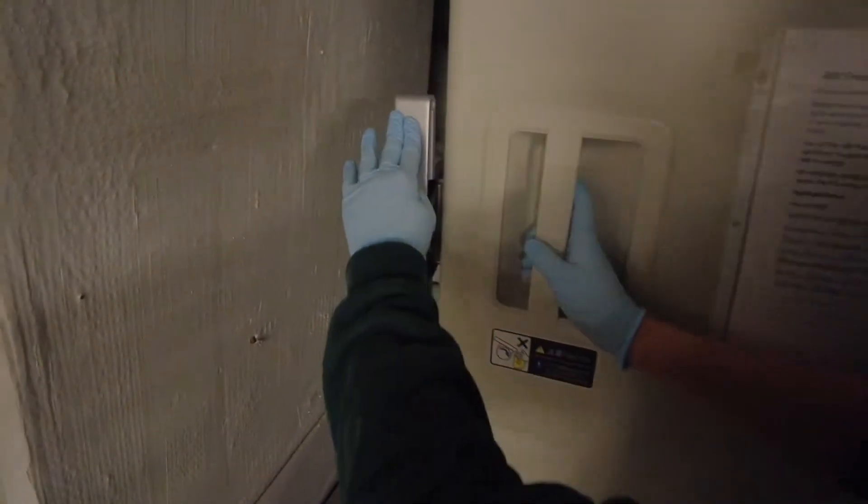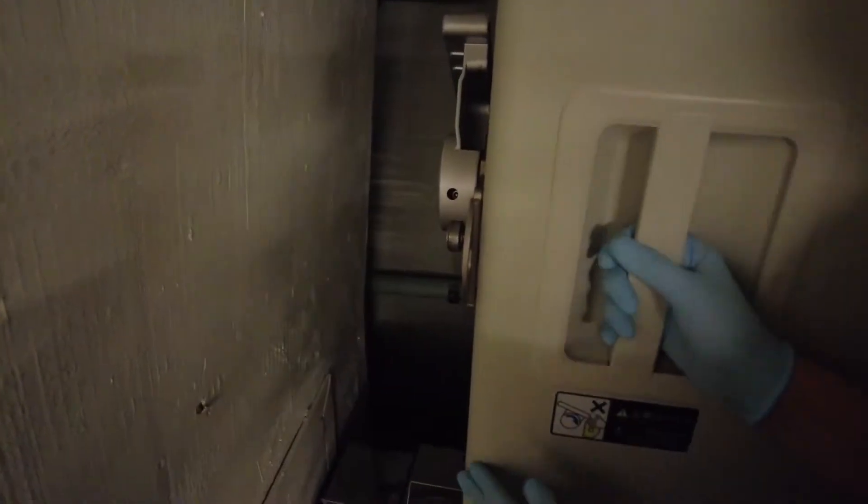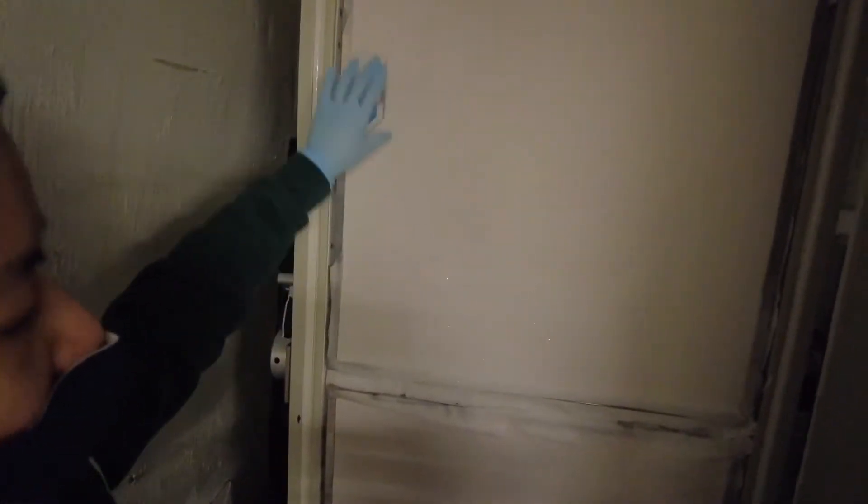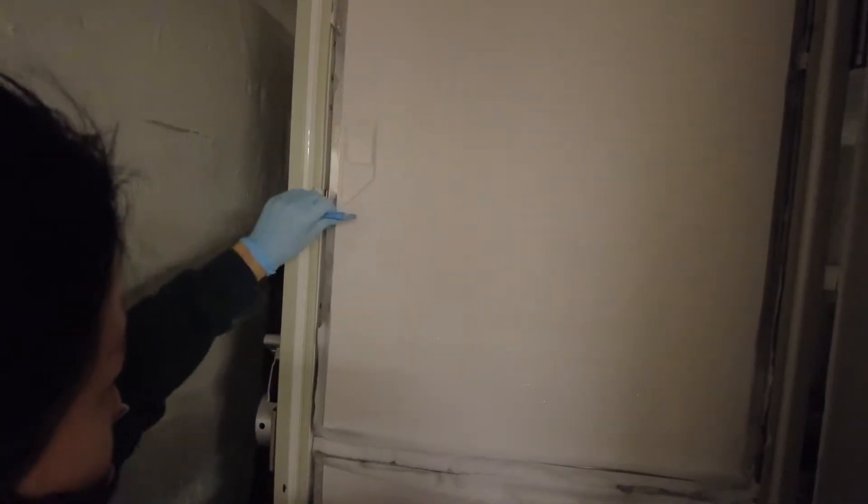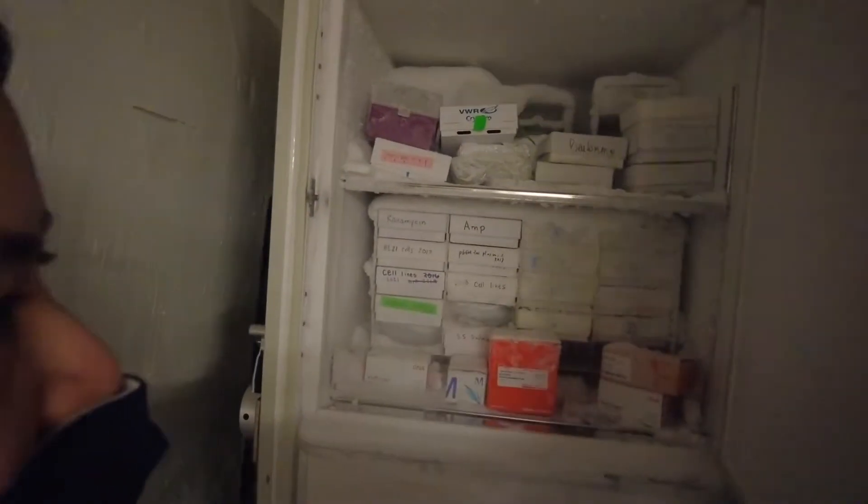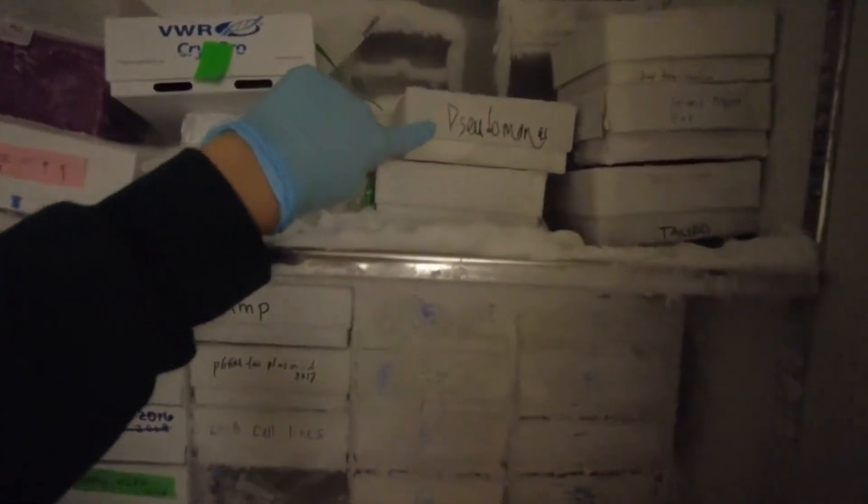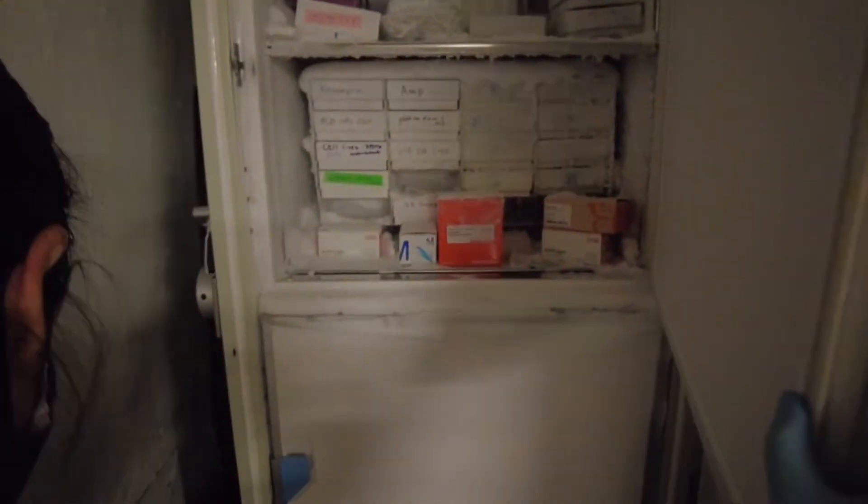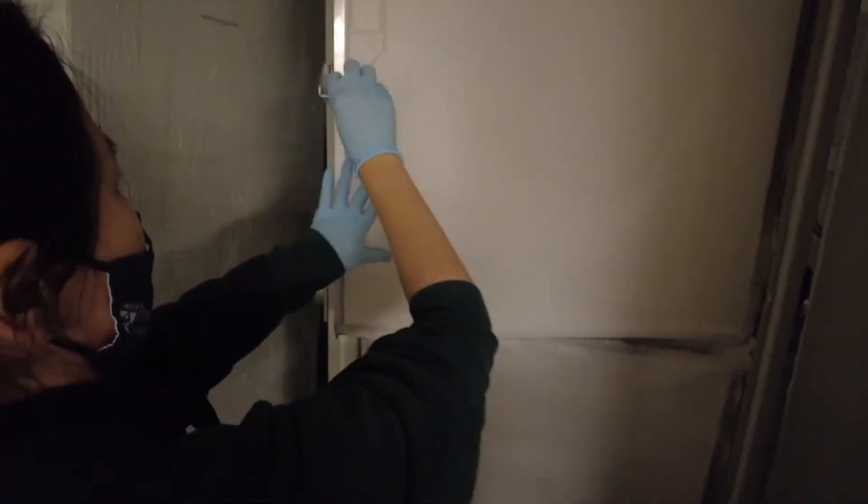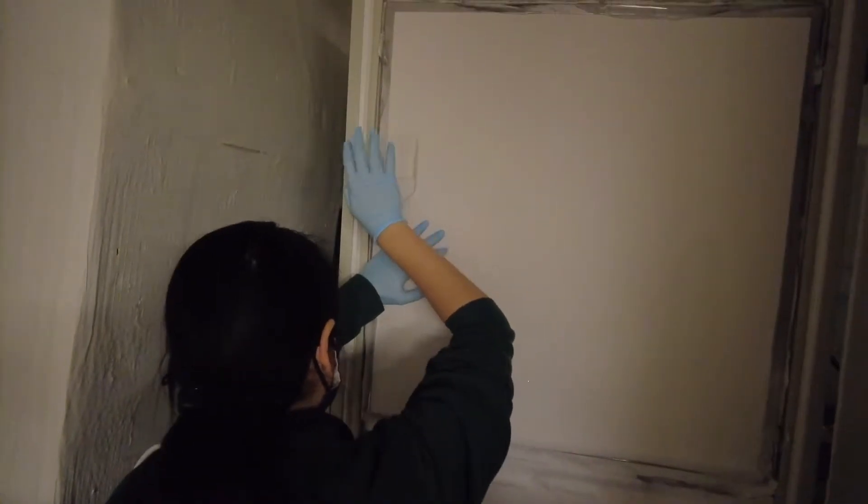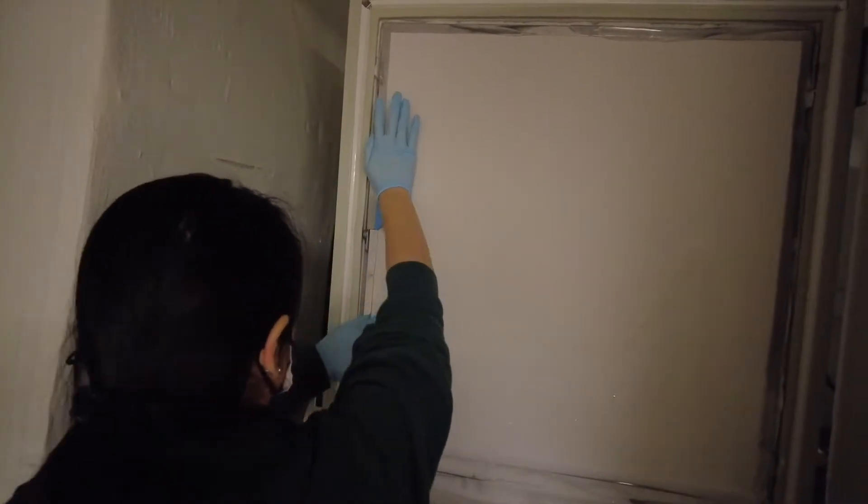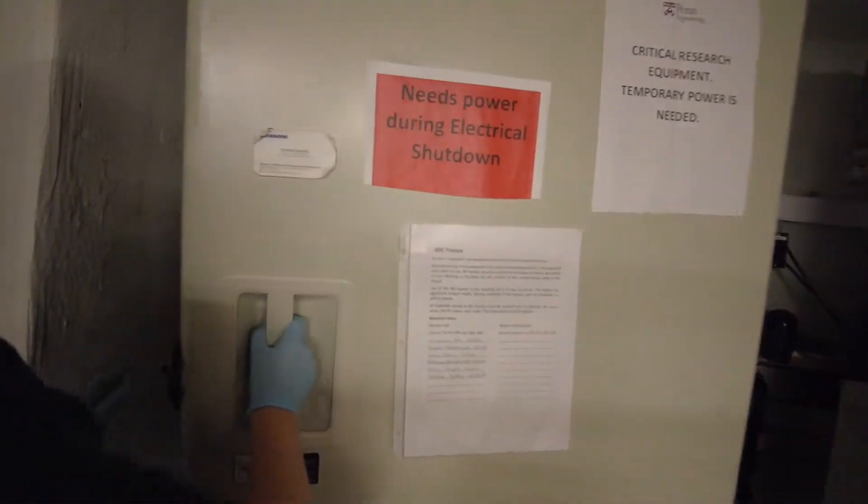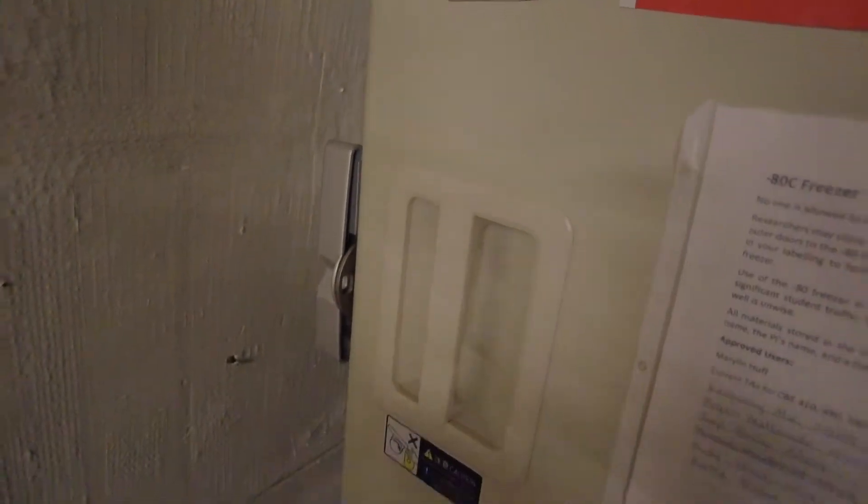First you open this latch switch and then you open this outer door. It's kind of hard for Ivy too. Our box is on this half of the freezer. We'll open this one and you'll see this box here, Pseudomonas. Just take this one out and sit it down, close this door and close this door.